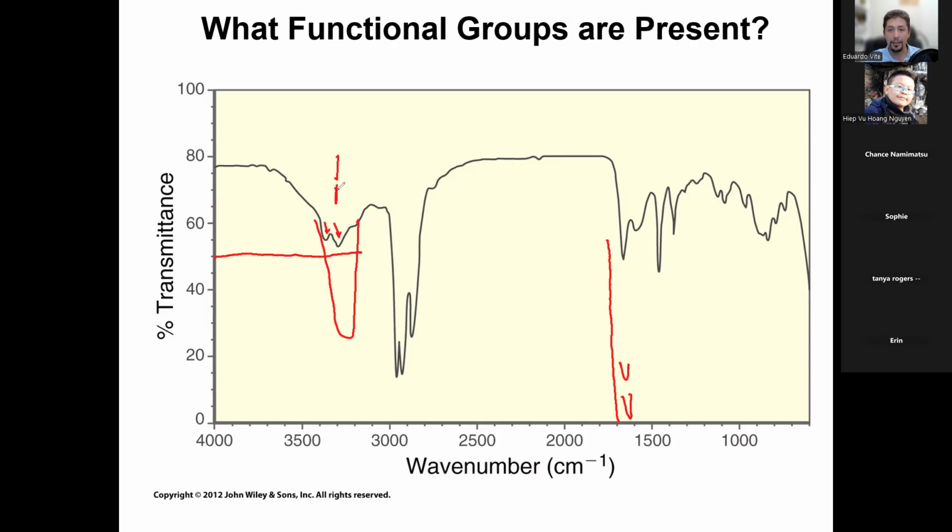So it's an amine with one carbon bond, and the other two are H and H. And these NHs are these peaks right here. Does that make sense? Let me clear the drawings real quick. Once again, this is your NH, and this is your NH. How can you tell the difference? They're weaker than an OH, and there are two of them. The OH is a single one.